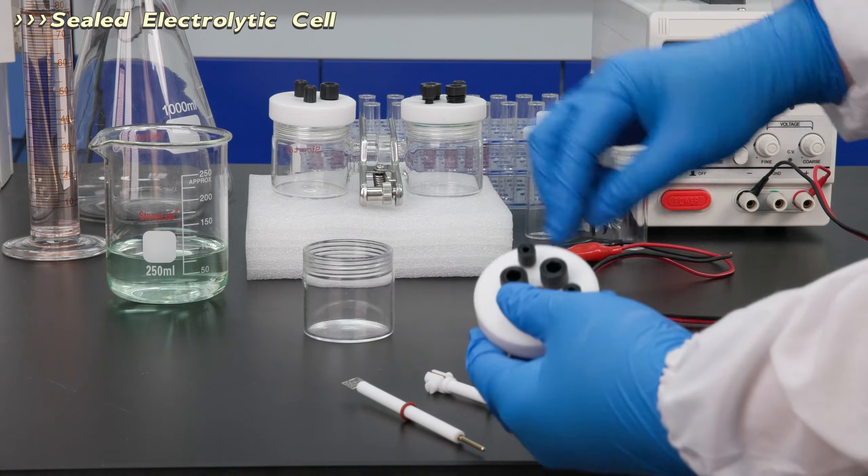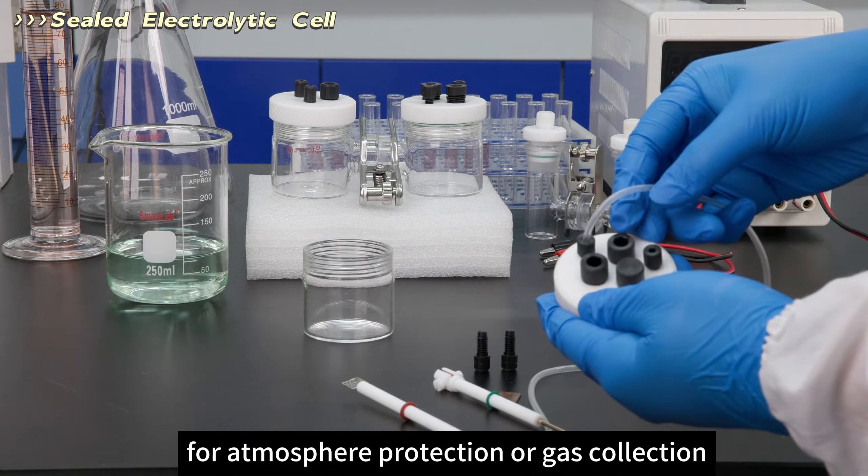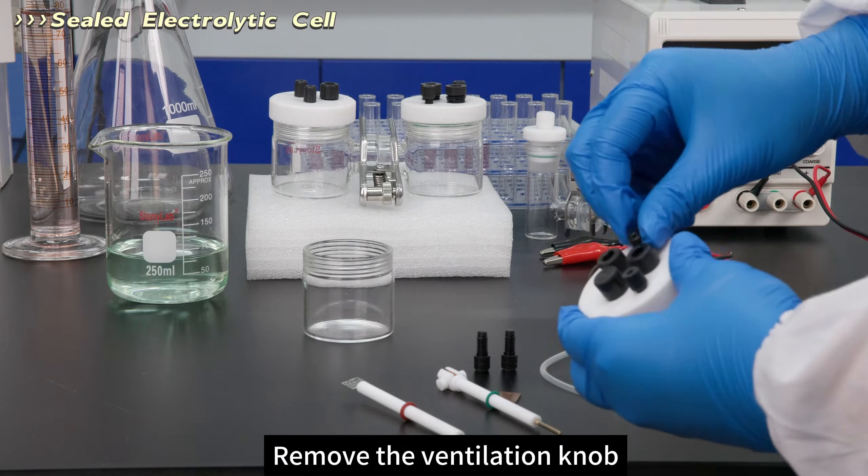How to set up an electrochemistry cell. The ventilation knob allows the insertion of a tetrafluoro tube for atmosphere protection or gas collection. Remove the ventilation knob.